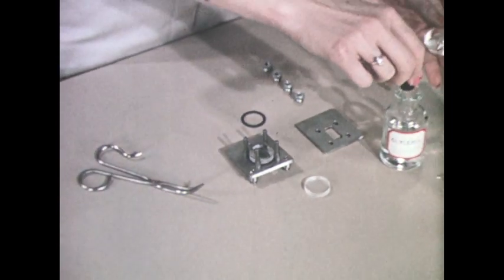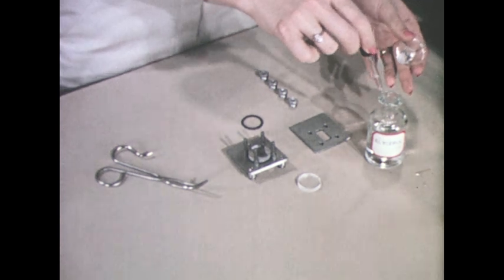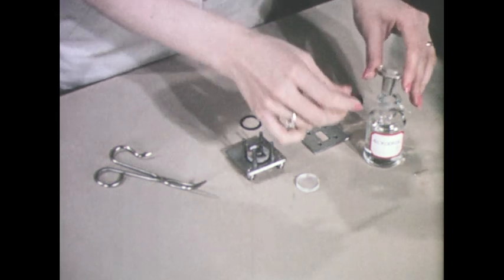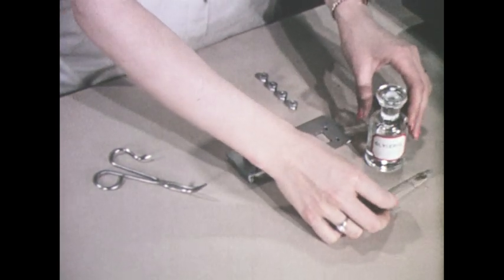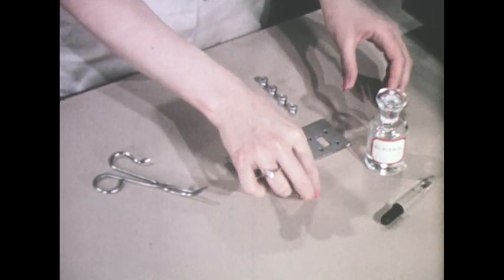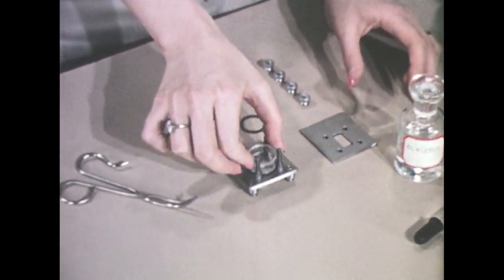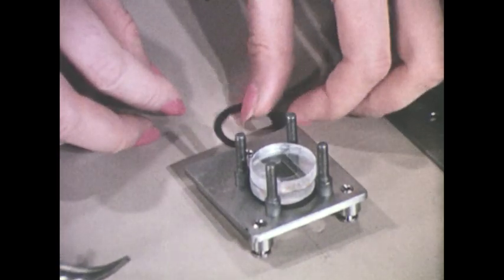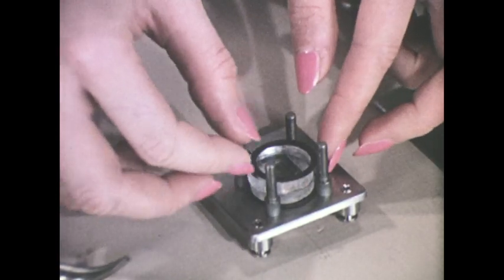The liquid is placed in the center of the metal spacer. The rubber gaskets prevent the rock salt windows from being cracked when the cell is assembled.